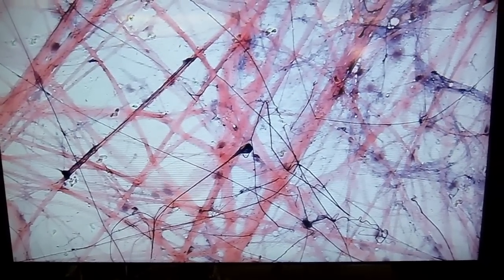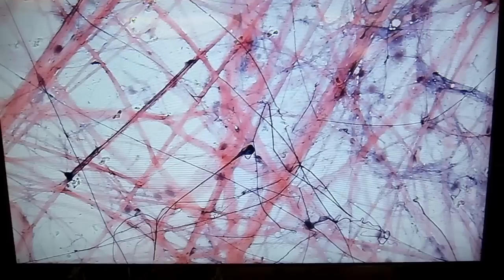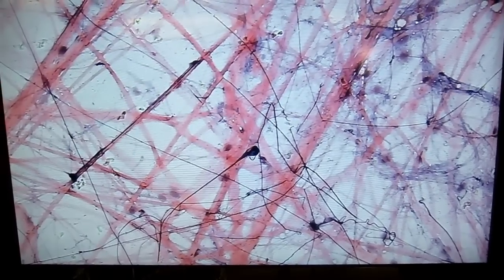Okay, so we're starting on the connective tissues now. We're going to go through the three loose connective tissues first.